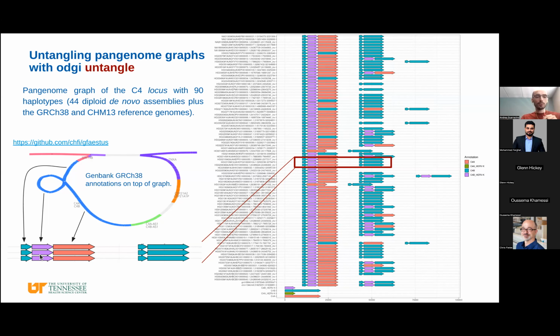In the first round, this purple arrow highlights that the first copy of the C4 gene is in long form, so it has the retroviral sequence. As I told you, in the variation graph, the paths are represented as walks through the graph nodes. So let's go through the nodes. The first copy has the retroviral sequence, so it goes through this loop.